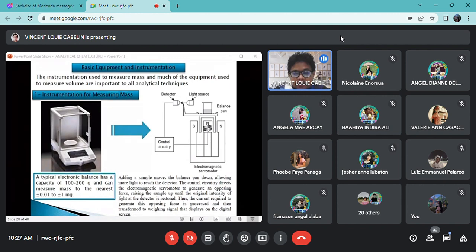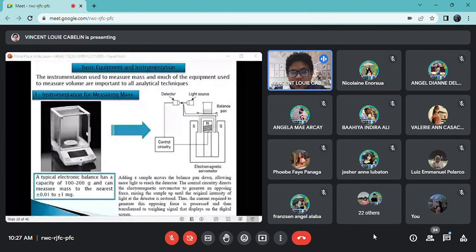Okay. In chemistry, we usually measure in small amounts, minute amounts in grams or micrograms even. That's why we have to use very precise and accurate measuring devices. Hindi ka pwedeng gumamit ng mga hindi analytical tools, okay? Because the errors are quite high in those types of tools, just like those tools used in the market that could measure up to 50 kilos.